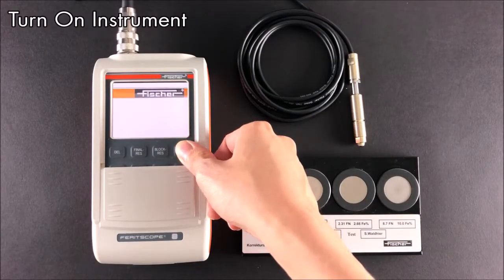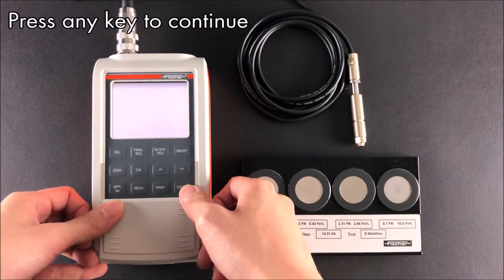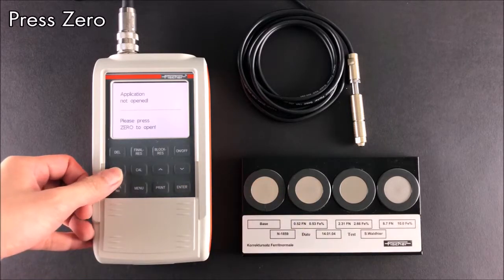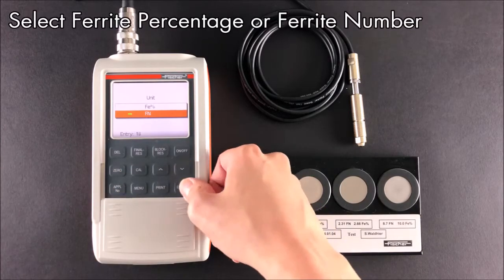Next, turn on the instrument. The instrument will prompt you to display ferrite content as ferrite percentage or ferrite number. In this case, I chose ferrite number.